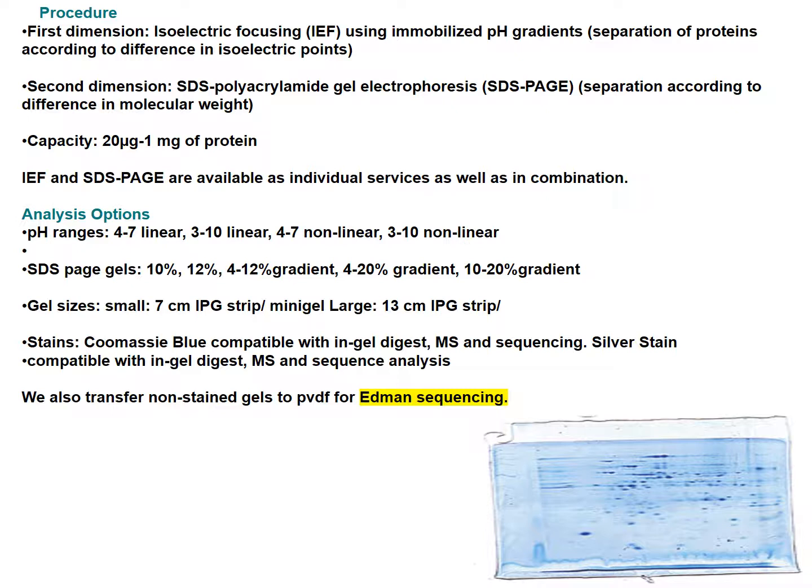So this is not the end. This is just the beginning of the beginning, right? Or the end of the beginning. And now we're ready to figure out, well, what's the difference between these two types of cells or two types of organelles? What does the ER and Golgi look like? What's the Golgi look like or the mitochondria look like? So if you had a protein that sometimes went into the nucleus and sometimes in the mitochondria, this kind of analysis would highlight that protein and say, hey, sometimes it's here, sometimes it's there, especially if I had an antibody against it.